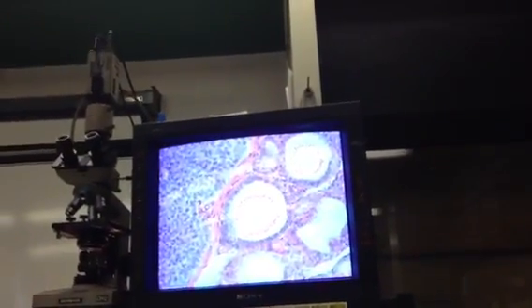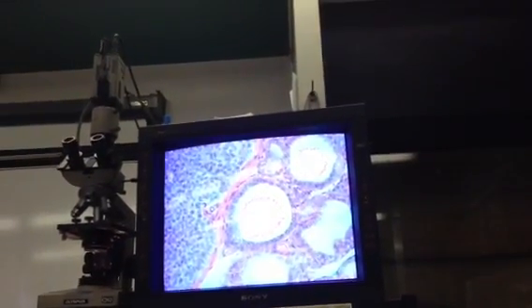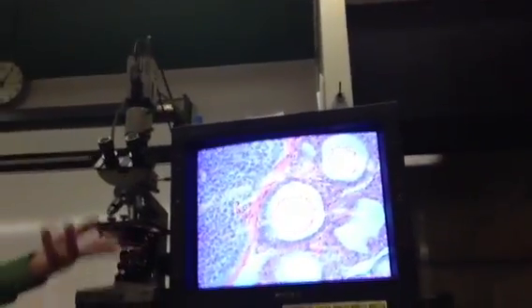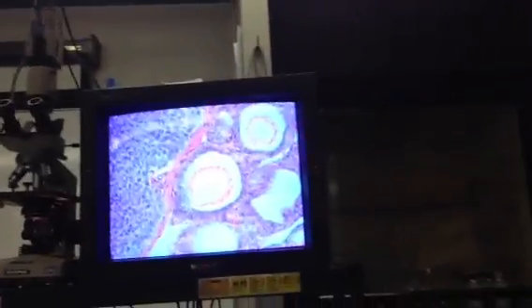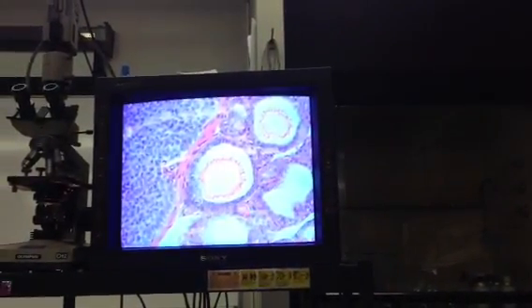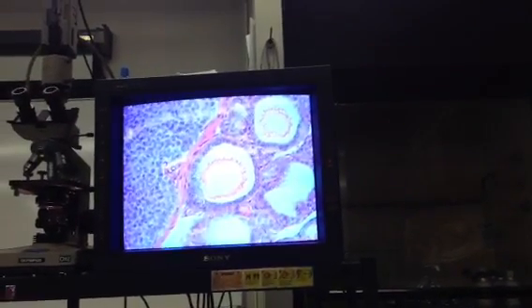That's thyroid gland. And I say, identify the structure indicated. You say, oh, I know that. That's a thyroid follicle. It may be a small artery or a vein. So I'll kind of throw that in every now and again because for some reason our thyroid slides often have very good examples of small arteries and veins. And you should be able to recognize what blood looks like. I will never ask you to identify a blood vessel unless it has blood in it.